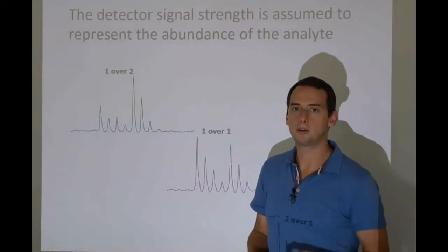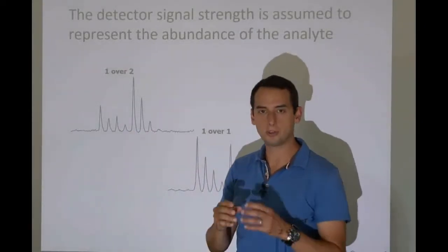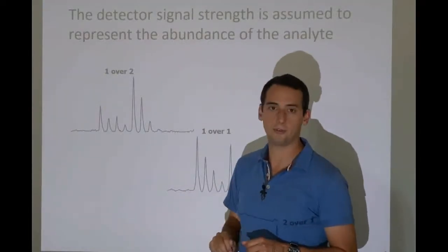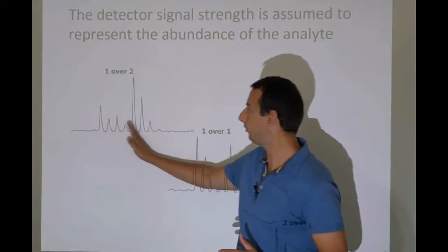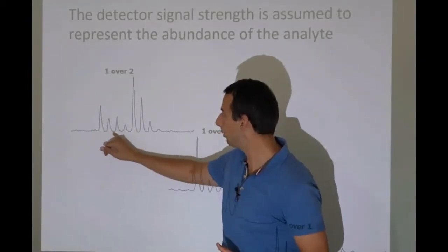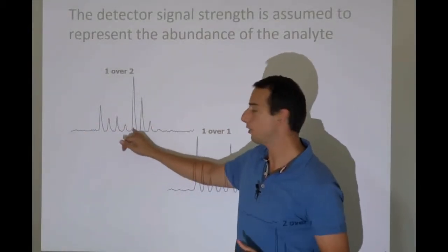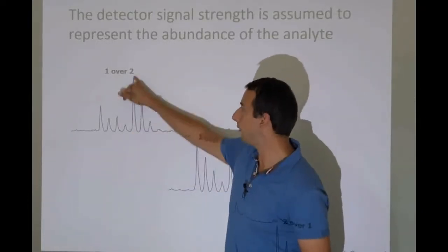we can actually do that, by the way. We can add neutrons to some of the atoms that we use in the synthetic versions of a peptide, which makes them heavier. So they move on the m over z axis. In fact, it moved here by 1, 2, 3, 4 daltons. Okay? So we made this one 4 daltons heavier. We did that in the lab. This is not in real life, but it gives us a reference.